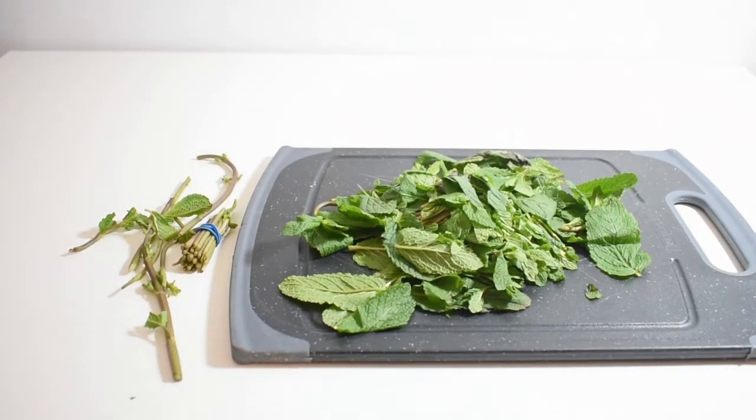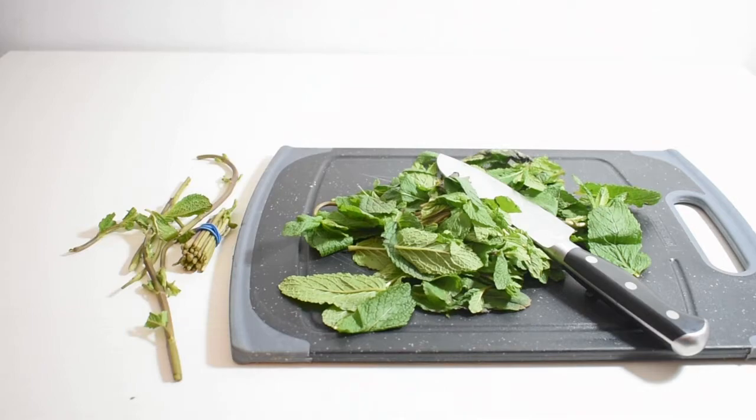Now that I have two packets of mint with the leaves separated from the stems, I'm going to chop up the leaves with a knife into smaller pieces. I don't want the pieces to be too small because that can cause a lot of foaming and problems in the next step.